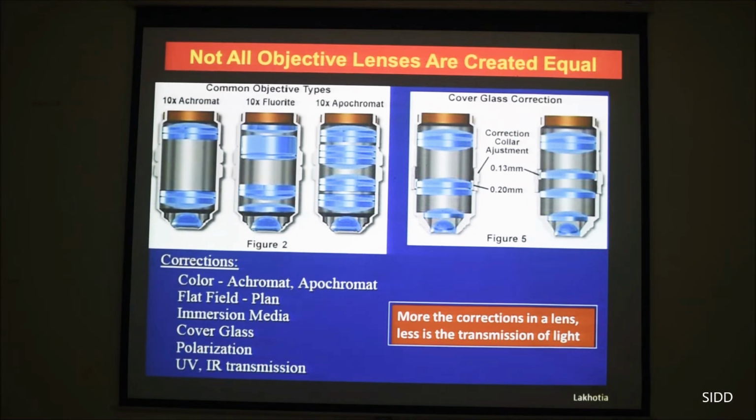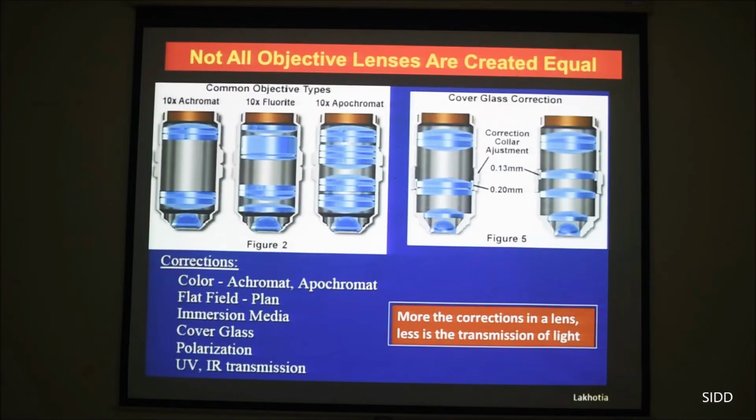The reason being that in the optical microscope we have two major aberrations. One is called the spherical aberration, the other is chromatic aberration. Spherical aberration, because it is a convex lens, although there is a point of focus, the image will appear curved instead of straight. Our eyes can continuously look at things which are far and away because you have accommodation. Our lens is soft, but glass being a hard lens, it will focus on only one point, and if the image is curved like this, it will focus either here or here.